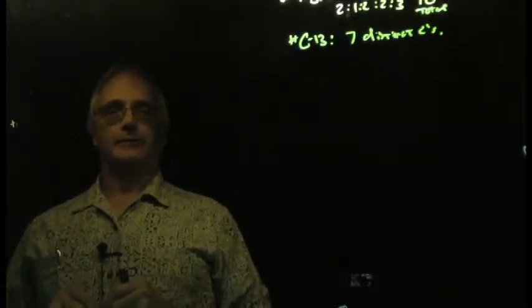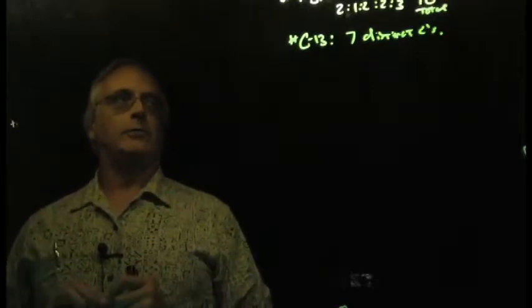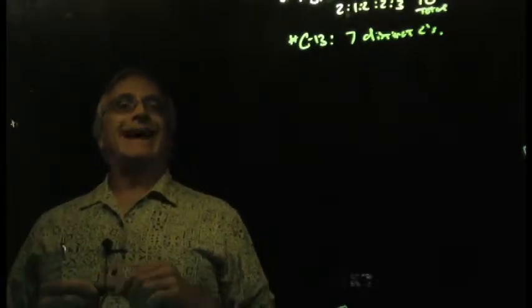Our new tool in the toolbox is the chemical shifts, and it's a very powerful one. And so now I start looking at the chemical shifts.